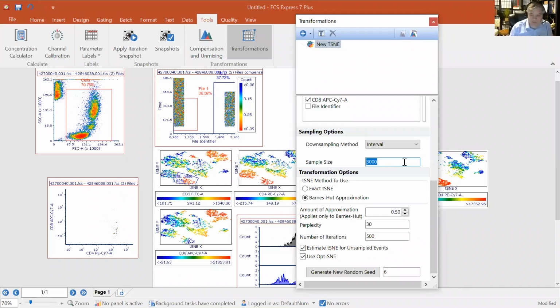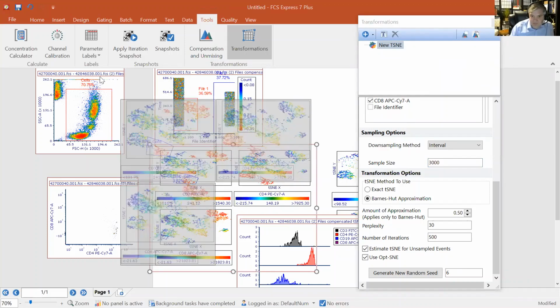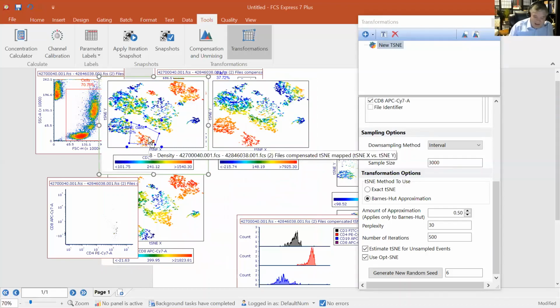And then we have another question about the proximity of clusters. They're asking if clusters in the t-SNE plots are not defined by proximity and only by backgating. Does proximity of clusters have no significance? Or is there a definition of a cluster based off of proximity, and what that cutoff might be as far as how close together those clusters are?